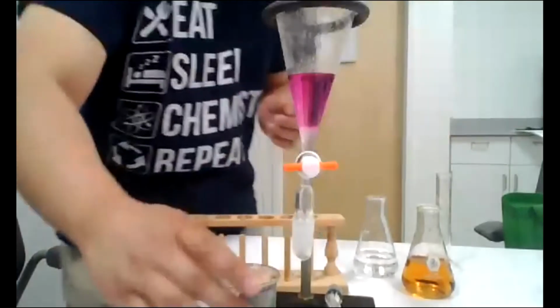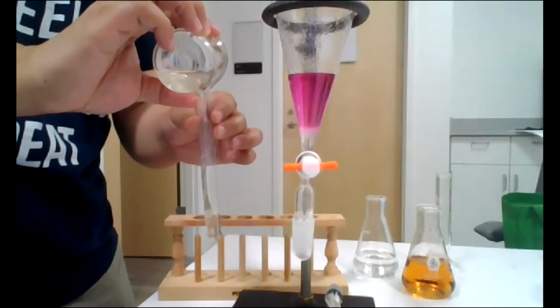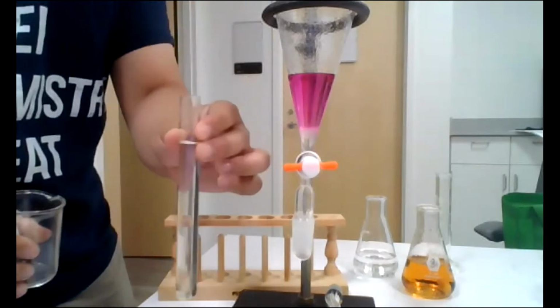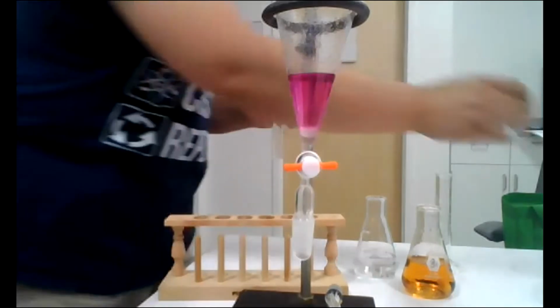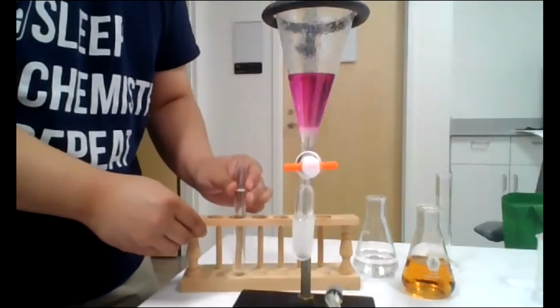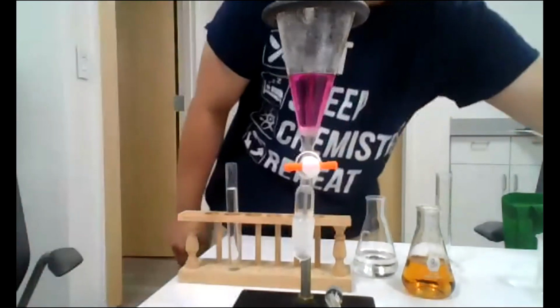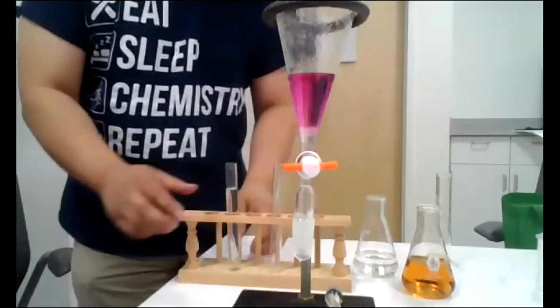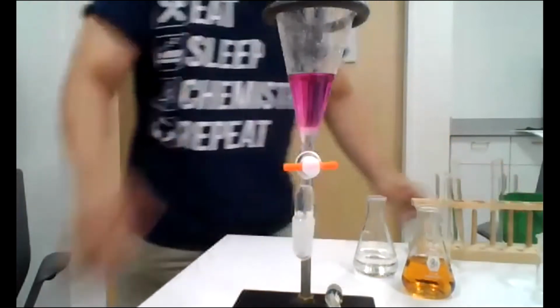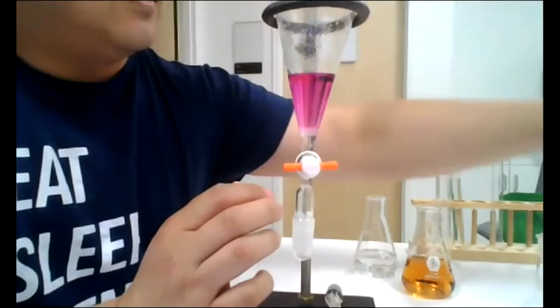So we're going to analyze this by sight. We're not going to use the spectrometer today. This one is going to be on the left. Okay. I have another test tube. I'll separate it here. That will be for our second part of the experiment, which we're about to do. We're done with the first part, okay? Because remember that first part was just doing one extraction with one serving.